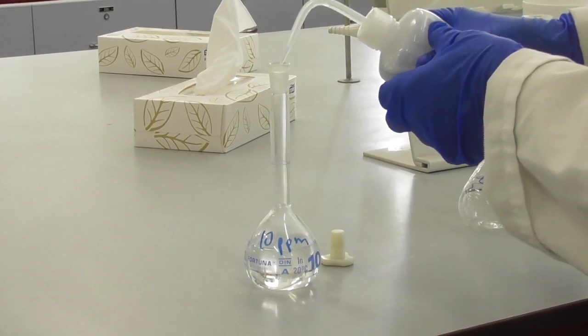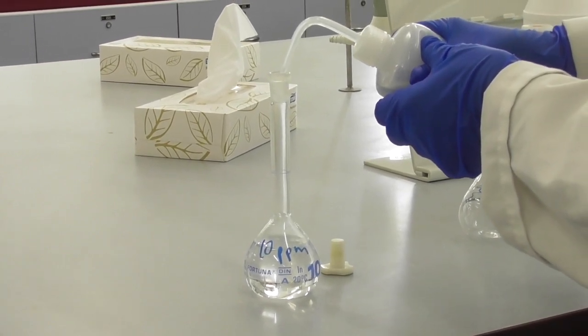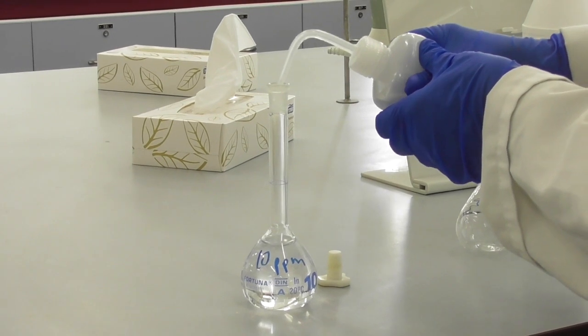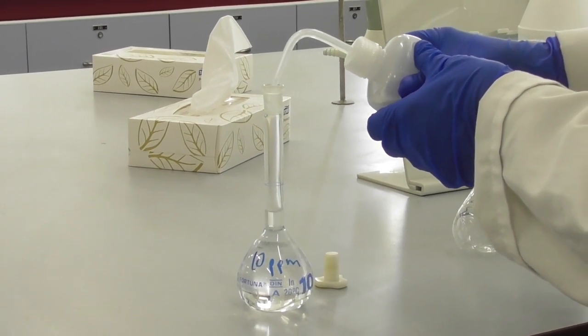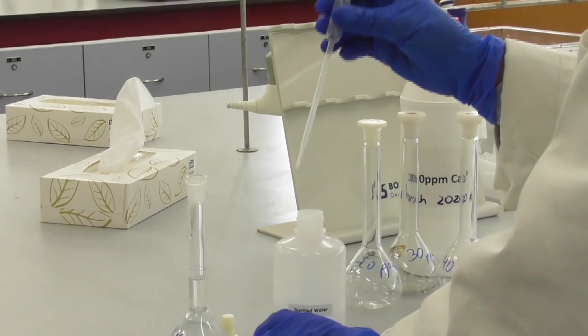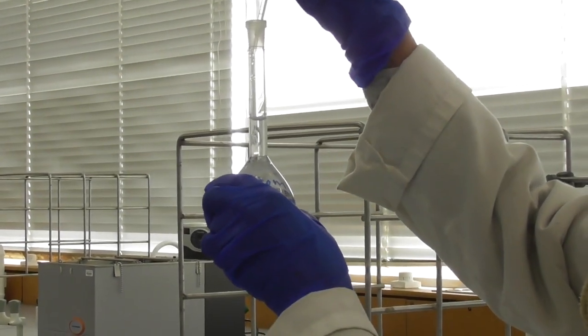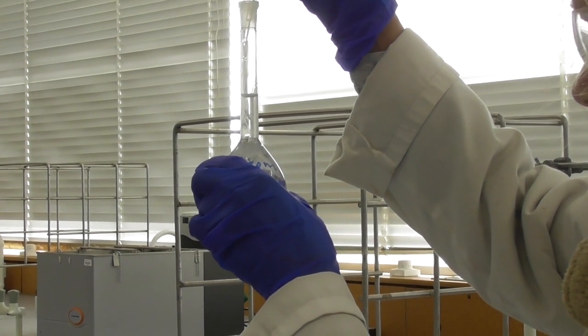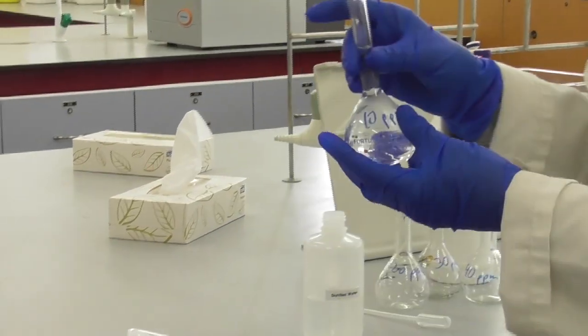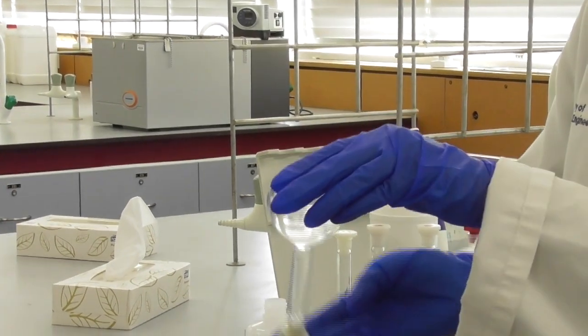I fill the flask to the line with distilled water. As usual when approaching the line, I use a dropper to add the last little bit of water and look at the fill level at eye level to ensure the meniscus sits exactly on the line. Again I have to invert the flask several times to make sure the solution is mixed well.